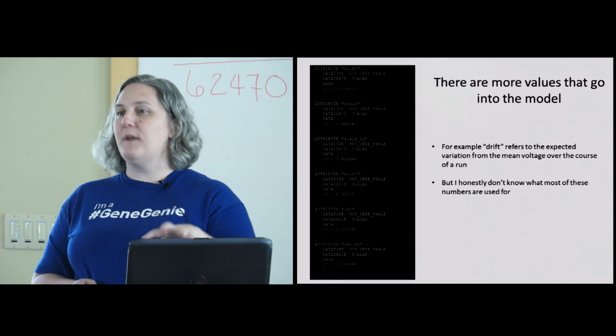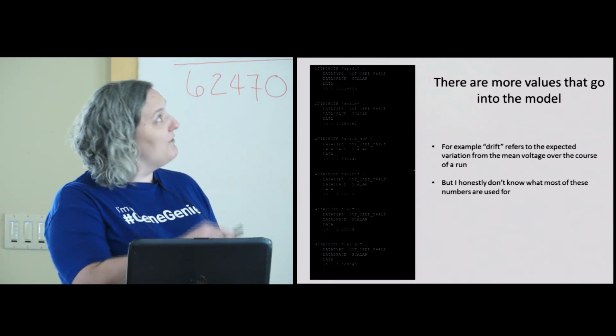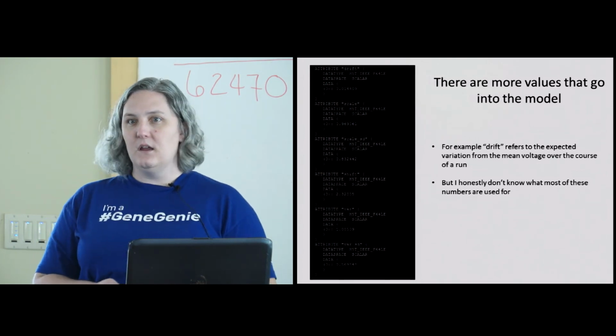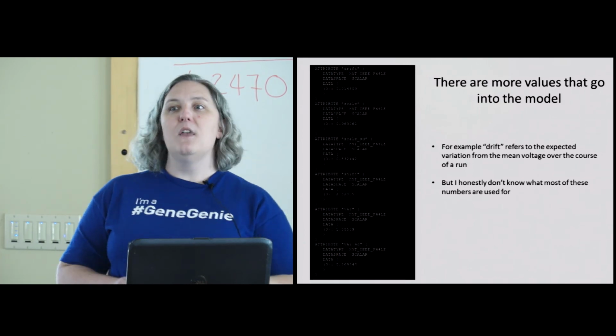And if you dig through these FAST5 files, which I find very tedious, it's all there, you can get every value that they're using in their really complicated model for predicting those 5mers. That's because there's not a lot of difference between each 5mer. It's very, very subtle. So they have to collect lots of information to try to model those minor differences to accurately predict what each 5mer is.